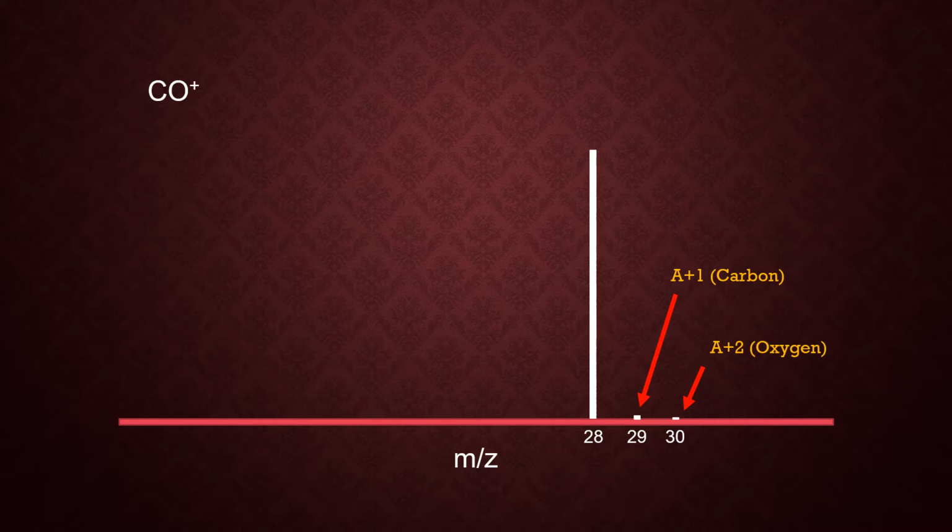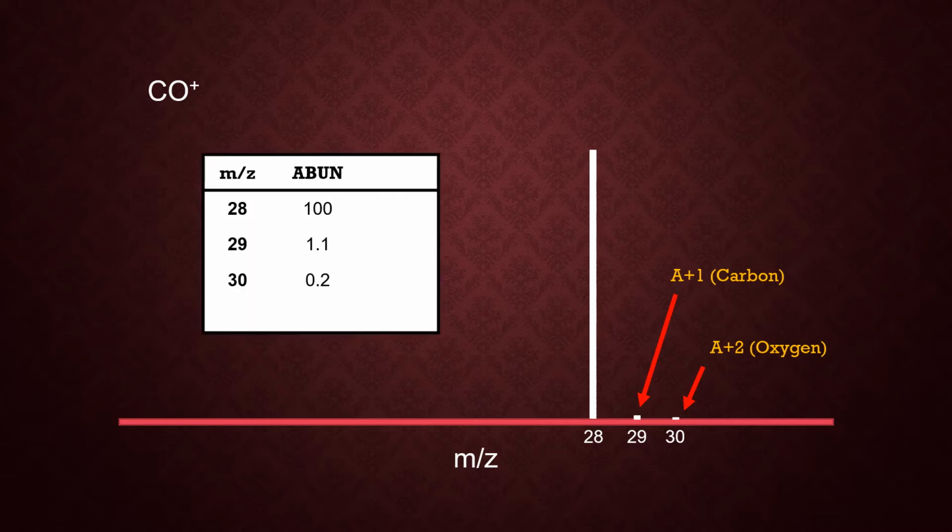Now, to analyze this and actually do the counting, you essentially make yourself insane looking at the histograms. So the histograms are of limited use, so we will also be presenting mass spec data tables of the actual abundances as measured by the analyzers. So in a modern mass spec, you would get both pieces of information.